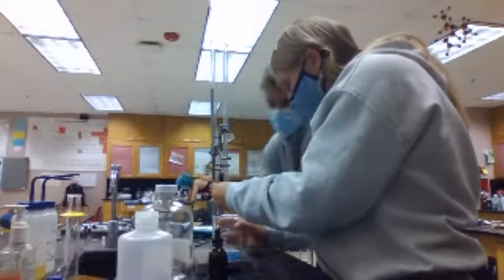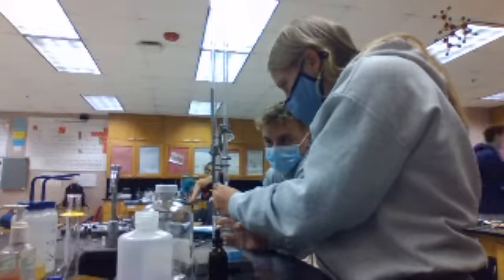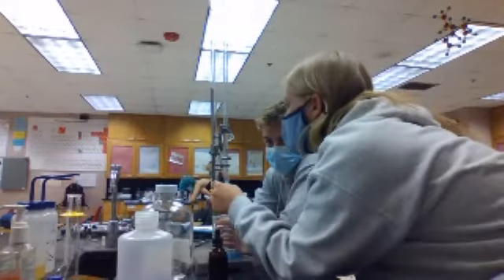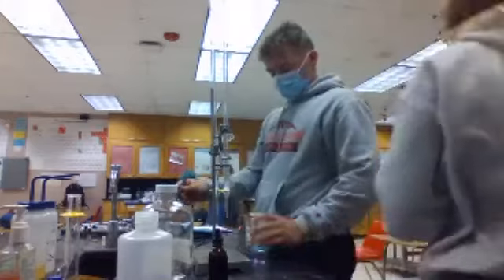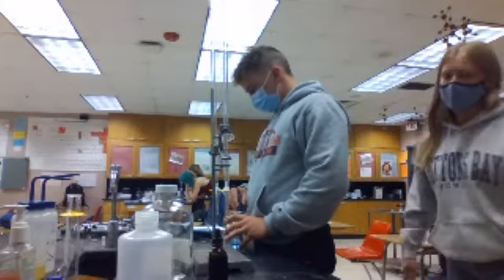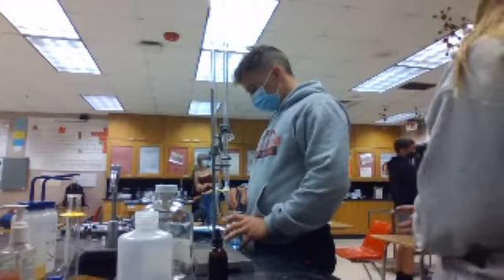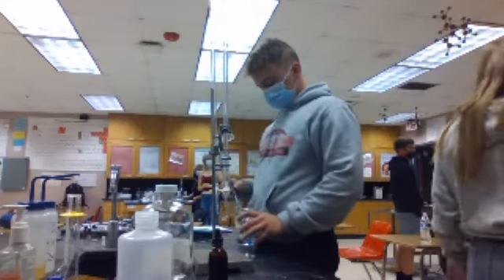Whoa, that's so hot, like crazy, right? Just from dissolving it, it's that hot. You guys really need goggles for this because this is almost 1 molar. It's 0.95. You could lose an eye on this one, please.